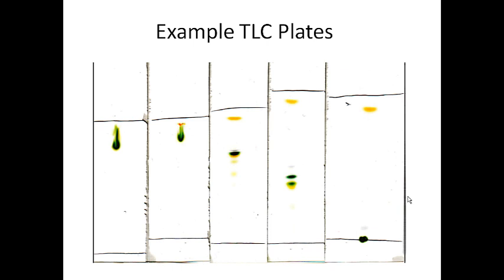And as I said in the last video, or if you haven't watched, when you do watch the TLC chromatography tutorial: in biology, when you do these kinds of experiments, you're doing gel electrophoresis. Gel electrophoresis separates on the basis of molecular weight. In organic chemistry, we are separating on the basis of polarity.